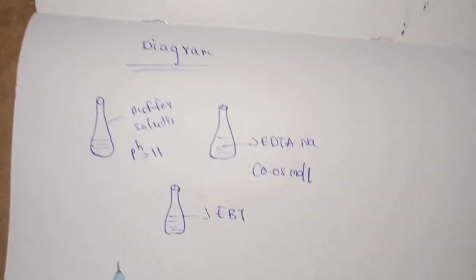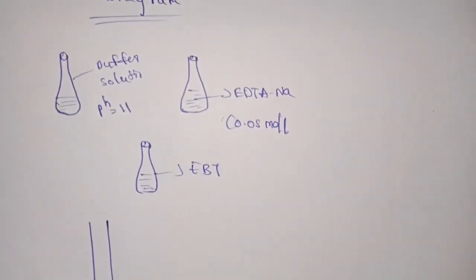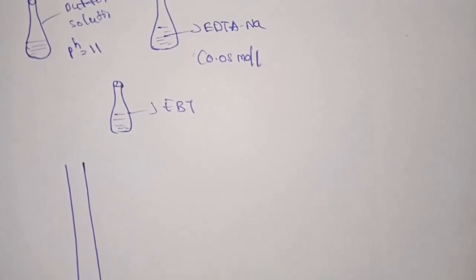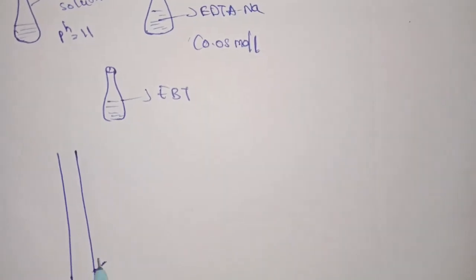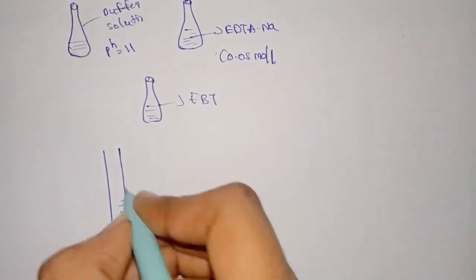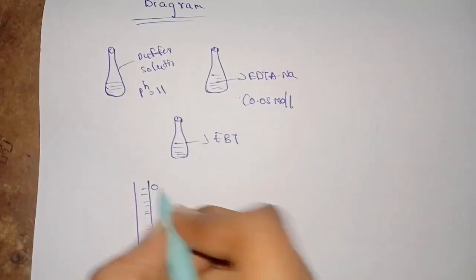Firstly we add EDTA to the burette. The diagram is not good, I think, but please adjust.